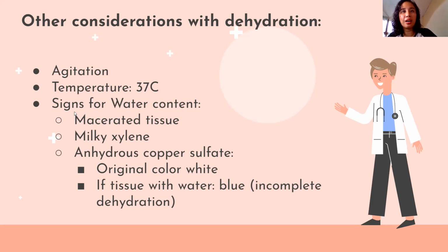And guys, we have to ensure that your water is completely removed. If not, the effect is the tissue looks macerated. It's soft, soggy yung tissue, hindi firm.